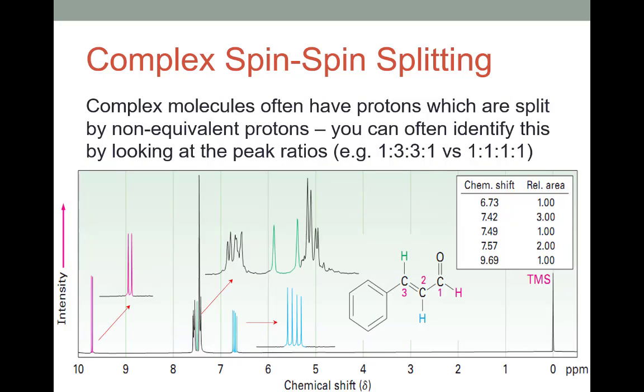Another example of that comes in this sort of complicated molecule here. So we have several things going on, right? If we go through this molecule step by step, we've got the ones that make sense, I guess you could say. We have the aromatic protons that we'd expect to show up as kind of an aromatic blobby mess of nonsense up around 6.5 to 8.5. And in fact, that's all of this stuff and all of this stuff. Sort of a mess of things going on.